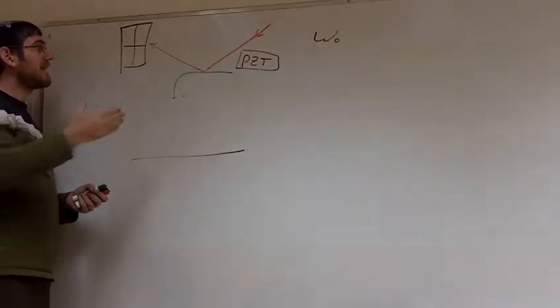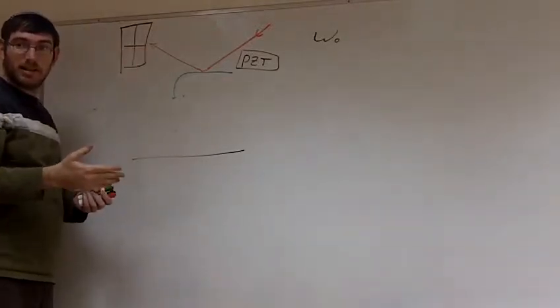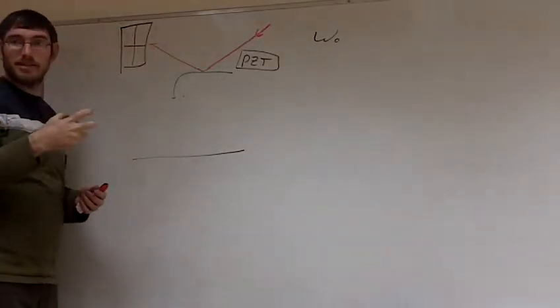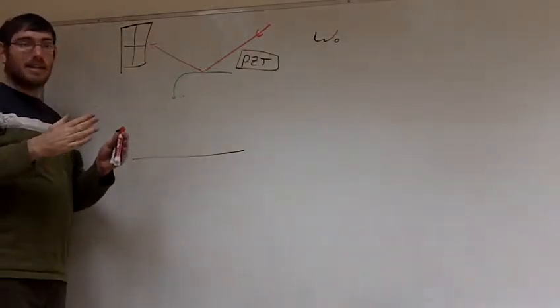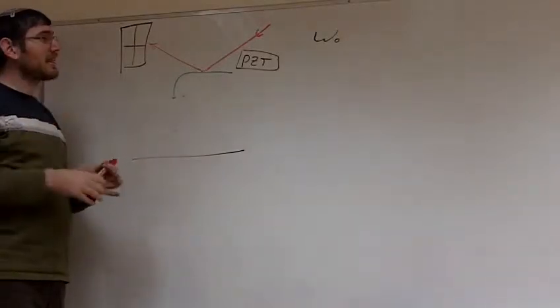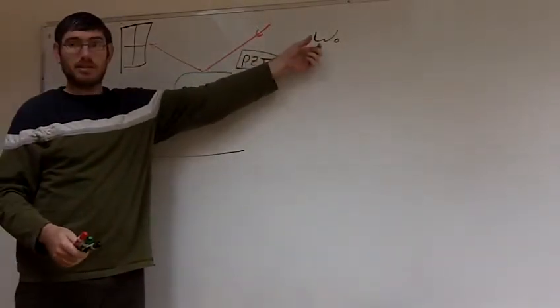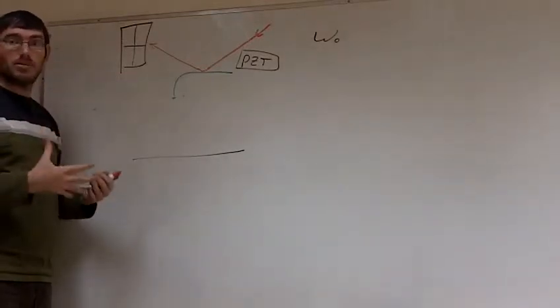But then what do we do with this signal? This is sent into a lock-in. The lock-in amplifier locks on to this frequency and can detect, or let's say filter out, all other frequencies, and then all other noises are filtered out, and we're detecting only a signal from this frequency. This way we can know if there are changes in this frequency. So let's now concentrate a little bit on how the lock-in works.